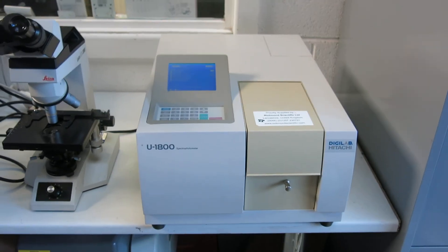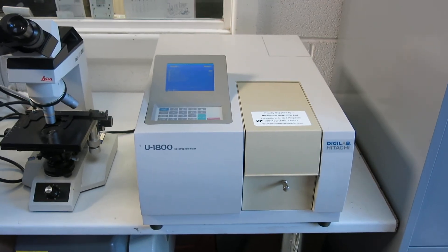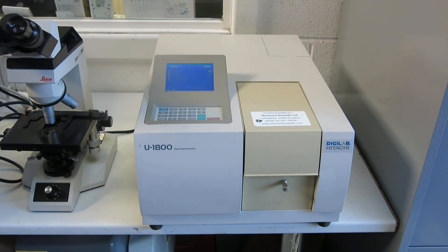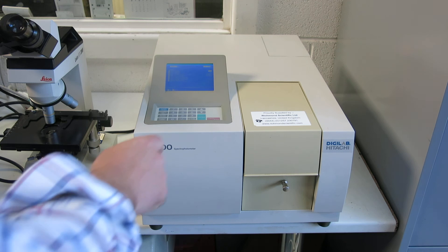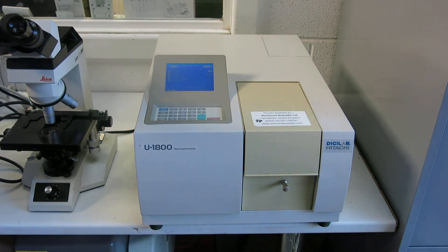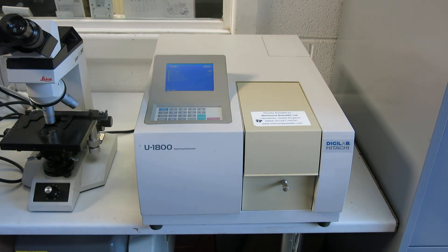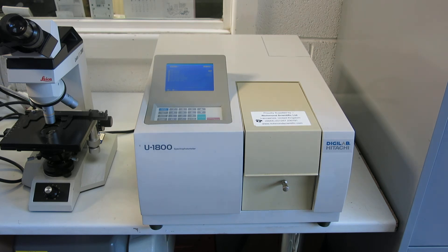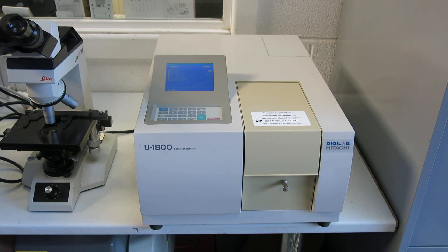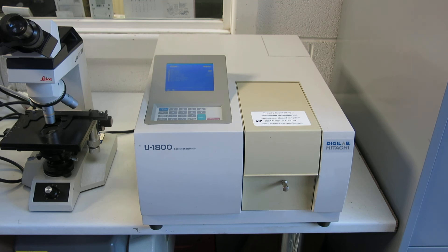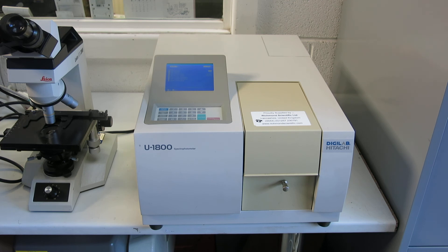Here we go. There's the instrument there. This one was last serviced in 2005 by the supplier, and it's been regularly maintained by a third party service company since then. I'll give you more information on this if it's appropriate when you contact Richmond Scientific.